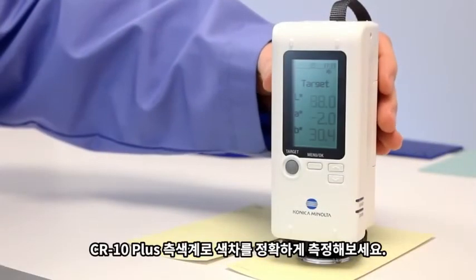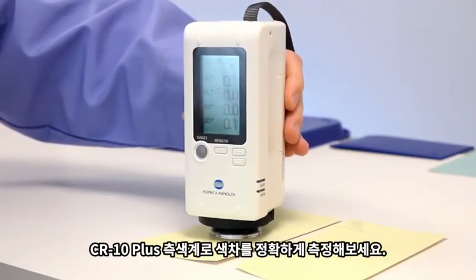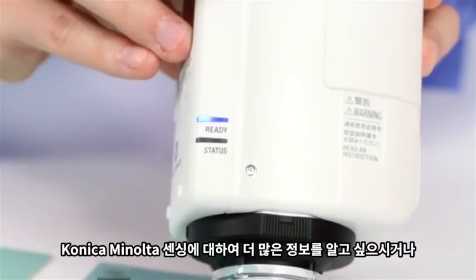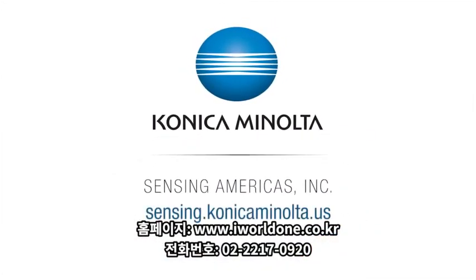The CR10 Plus Color Reader allows you to measure color difference with confidence. For more information on Konica Minolta Sensing's full line of color measurement solutions, visit us online at sensing.konicaminolta.us or call 888-473-2656.